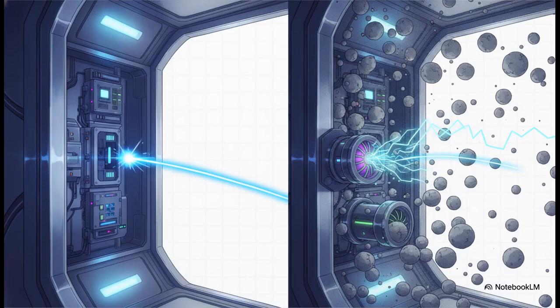But there is a massive catch to making this whole thing work. This entire journey has to happen inside an ultra-high vacuum.